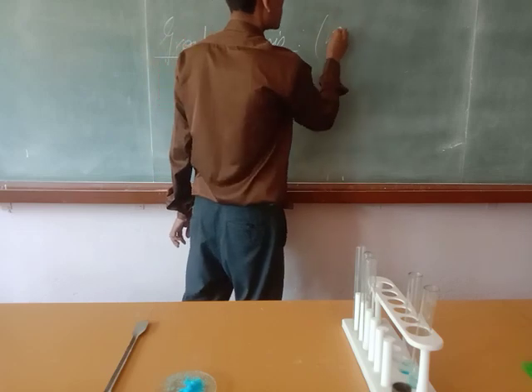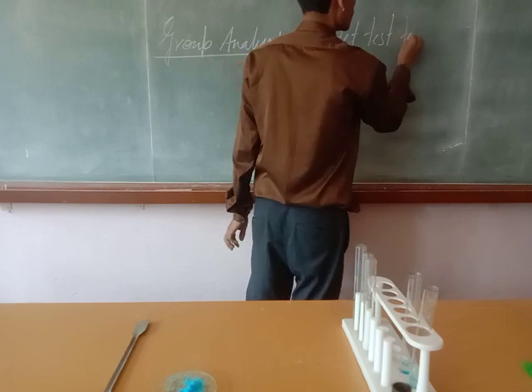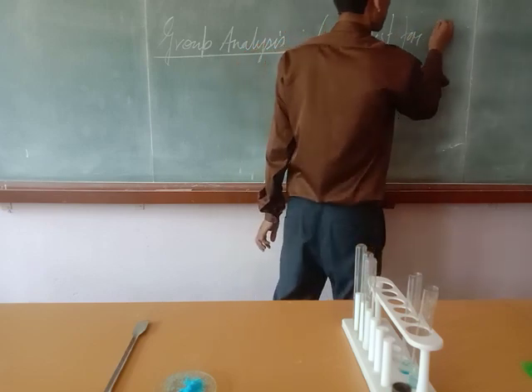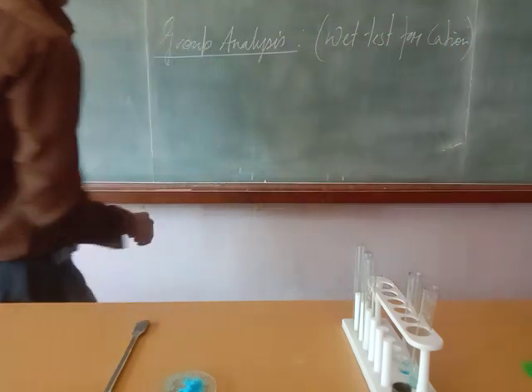You can write wet test for cation. So this is our heading.